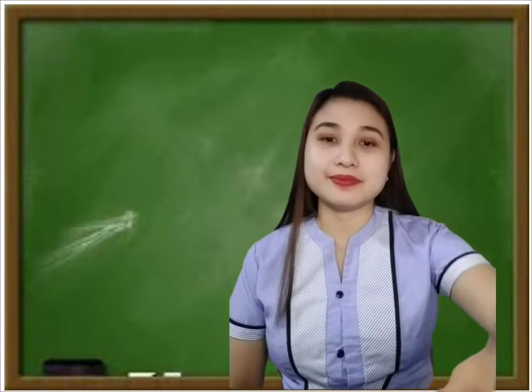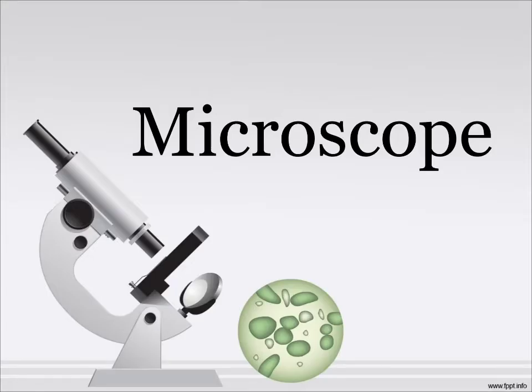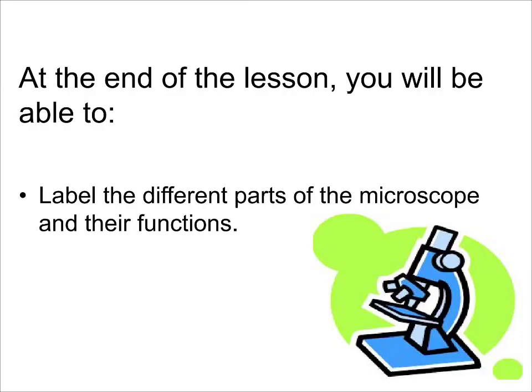Yes. Microscope. So now we're going to talk about the microscope. At the end of the lesson, you will be able to label the different parts of the microscope and their functions.